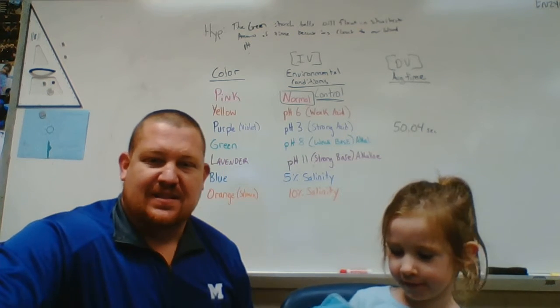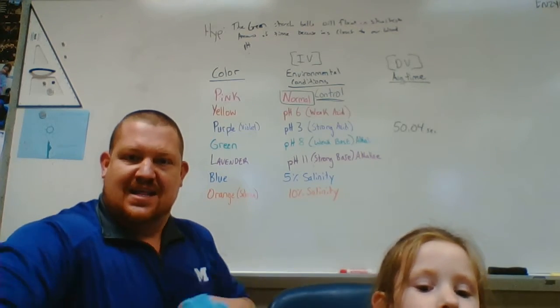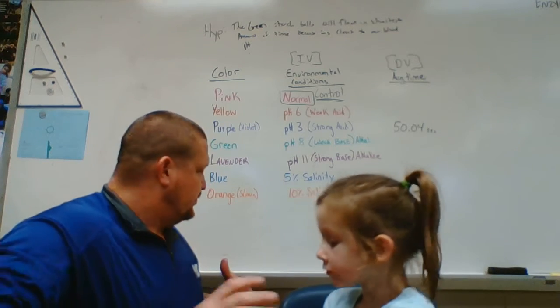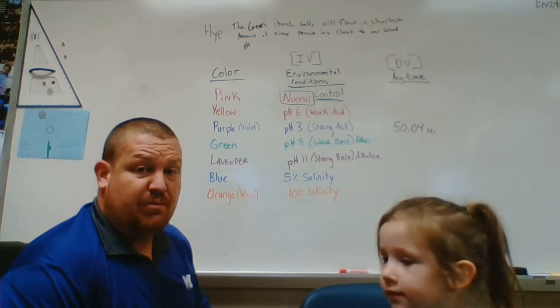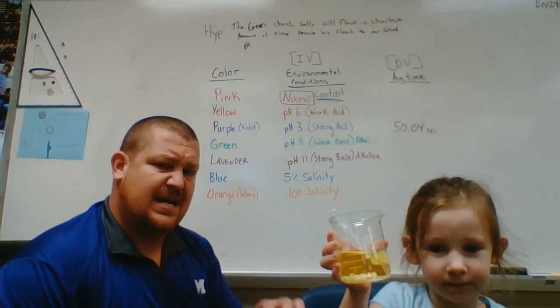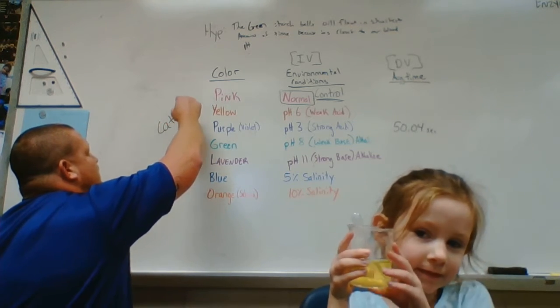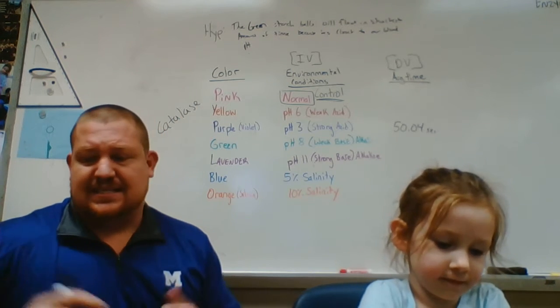All right, so today we're doing the starch, the yeast sphere experiment. All right. Cool. Okay. We are studying a protein, an enzyme specifically. Proteins can be a lot of things. They can be enzymes. So we're studying enzyme function of an enzyme called catalase.